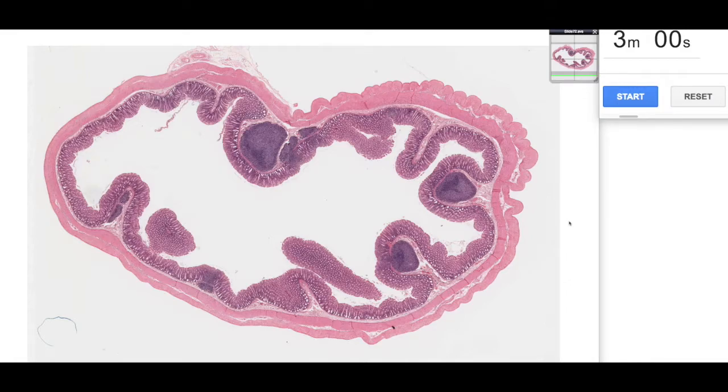Hi and welcome to another episode of 3 Minute Histology with Jamie Chapman. Today we're going to be looking at the colon or the large intestine. So let's start our three minutes.